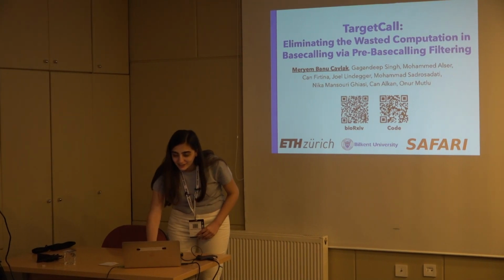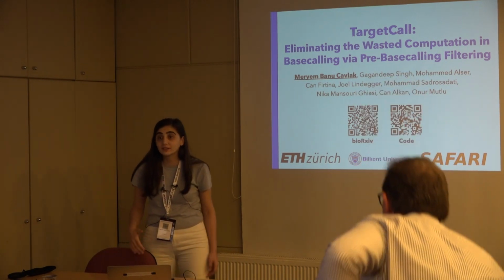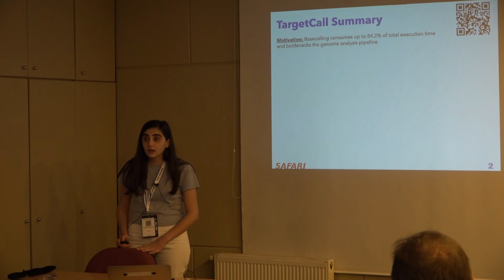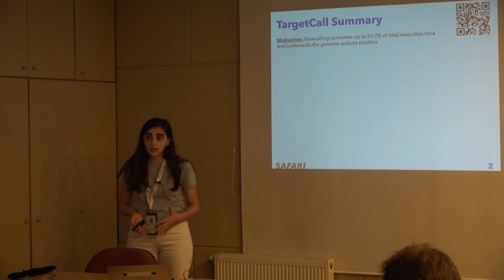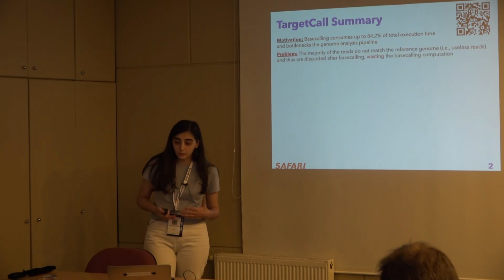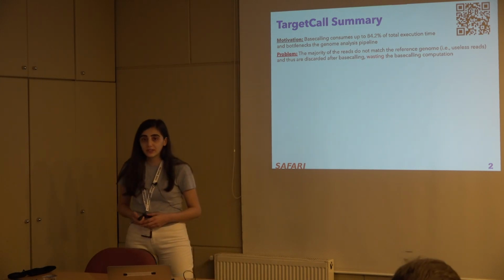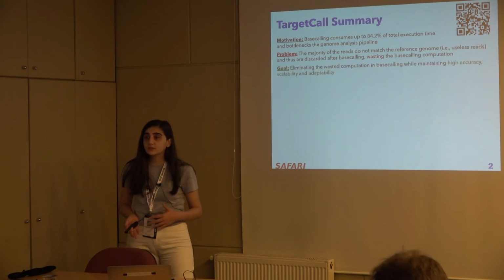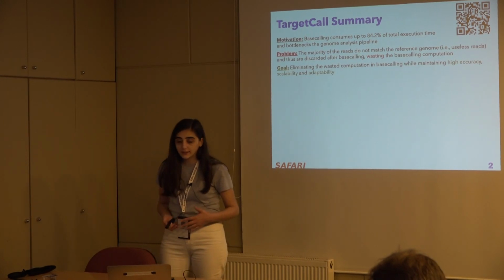Okay. As Onur said, I'm Banu and I will present TargetCall, which was done at ETH Zurich by the Safari Research Group. Our motivation in this work is that basecalling can consume up to 84.2% of the total execution time, and it becomes a major computational overhead for the pipeline. What we observe is that much of this computation is wasted because the majority of the basecalled reads are discarded after basecalling. Our goal is to eliminate this wasted computation in basecalling with high accuracy, scalability, and adaptability.